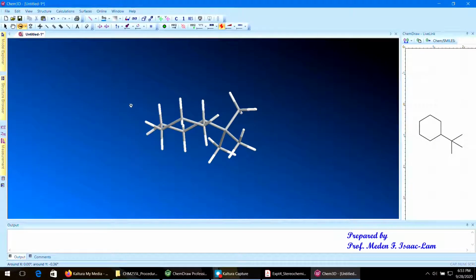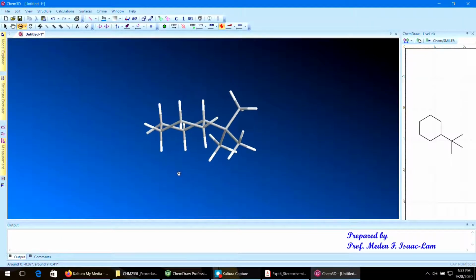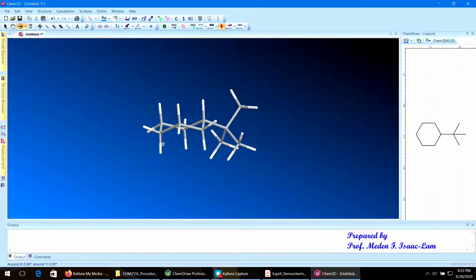So just write that down, please. So we are determining the dihedral angle composed of this plane and the plane behind, this angle. But it's not really a bond angle because you have 3 bonds. So one bond coming from H14 to C2, and then C2 to C3 behind, and then C3 to H15.